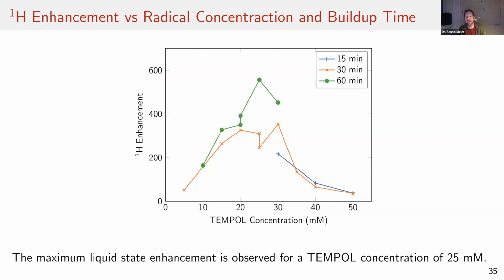And if you want to determine that binding strength, then you need to be able to detect this small molecule at that concentration. And this is something that we believe we may be able to do, but that would be probably impossible with conventional NMR. That's when hyperpolarization comes into play.